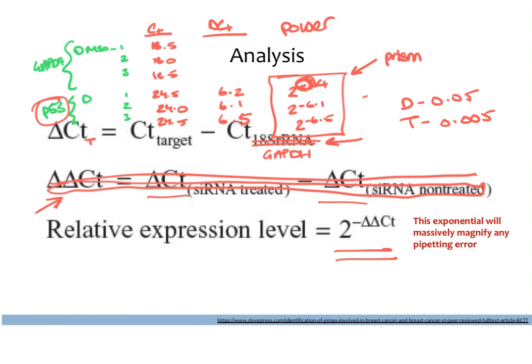But what might be helpful is to normalize this so that it's 1, and then this becomes 0.1. And so now everyone can clearly see that this is 1/10 of this. Or alternatively, what you normally see is more like this is 1 and maybe this is 3 or 5 or 2. And so then you can say, I have a 2-fold change in my treatment over my control. That's really the kind of statement you want to be able to make.